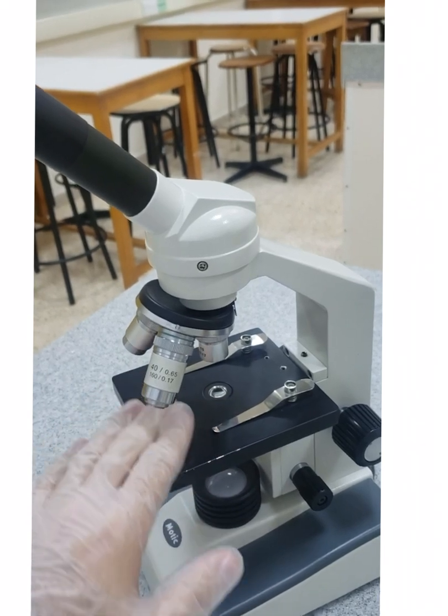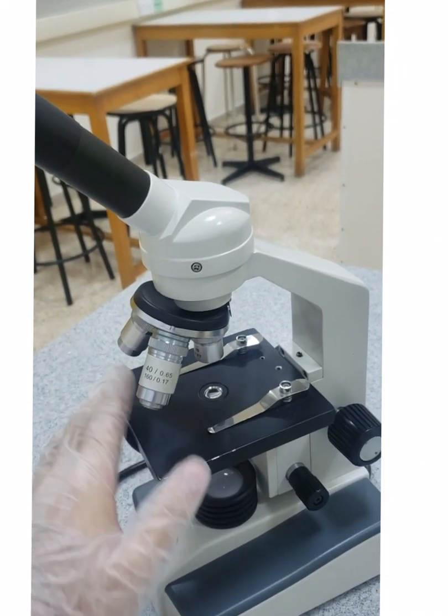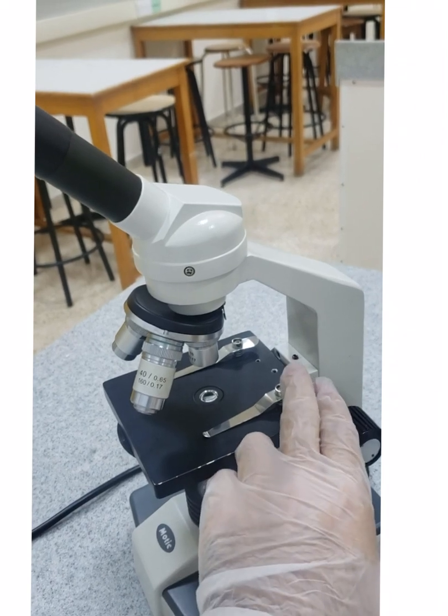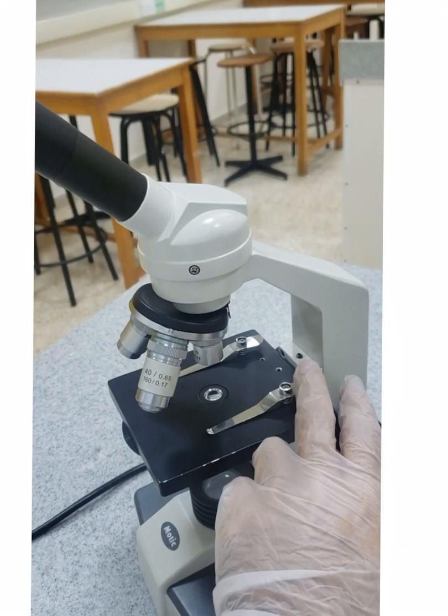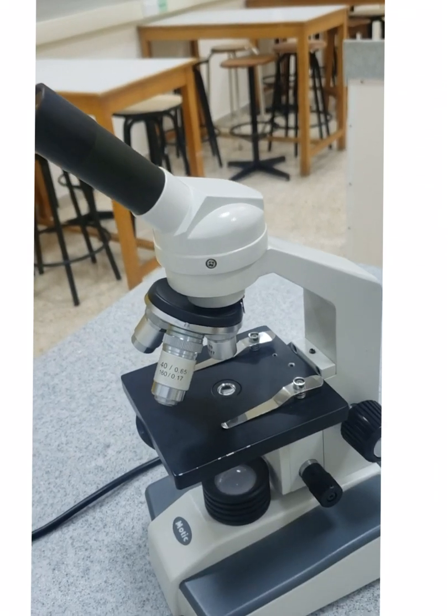The slide will be on this stage. This is called the stage. This slide will be fixed using these stage clips. They are used to hold the slide in place.